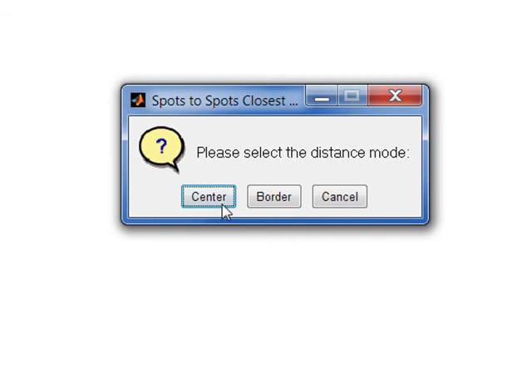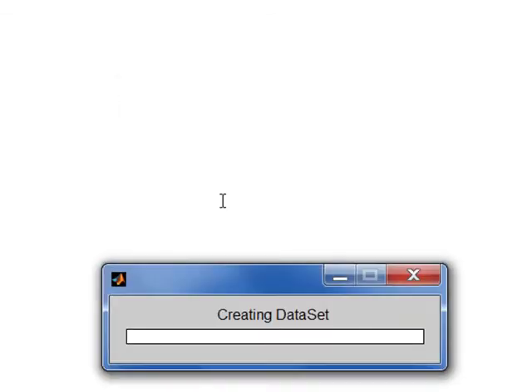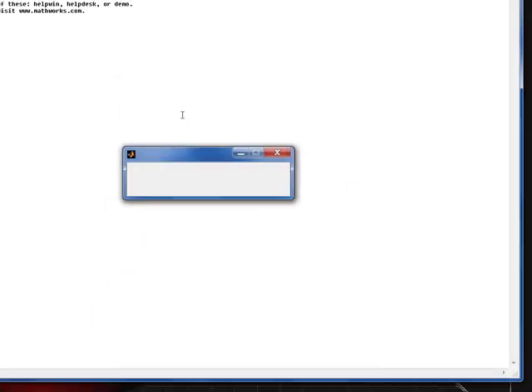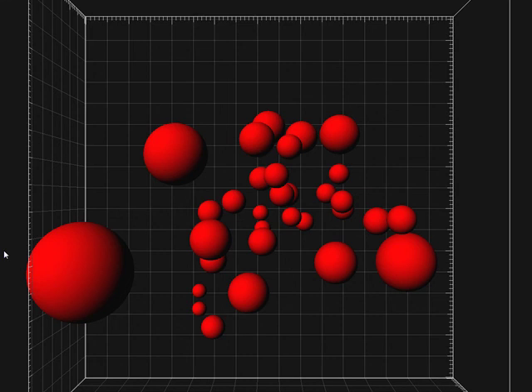In other cases, measurements between object centers might be more suitable. All previously shown examples were based on measurements between object centers.